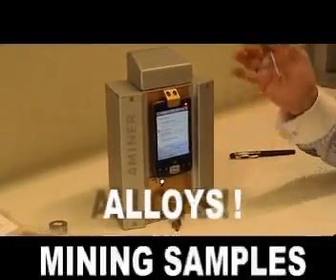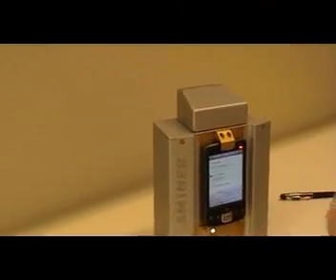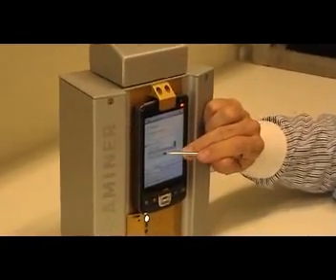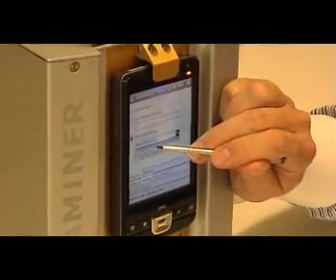It's also possible to calibrate it for alloys, but this one has been calibrated for mining samples. So we go to factory calibration, we go to basic mining calibration. We also have an extended mining calibration, but we choose the basic mining calibration.